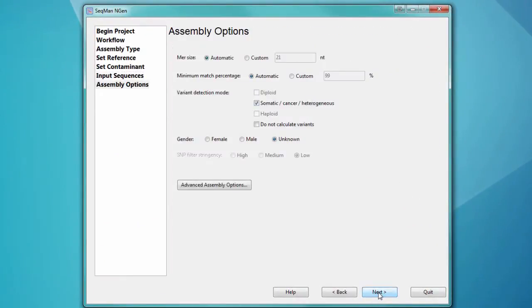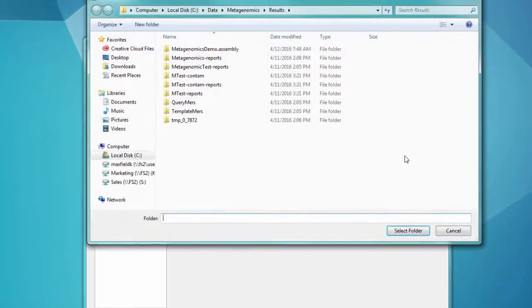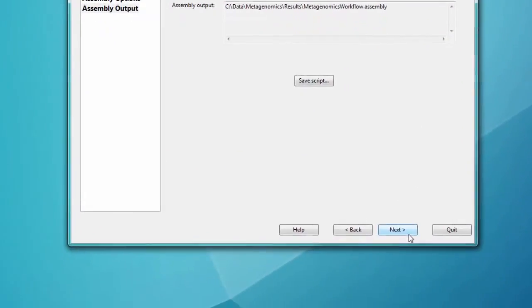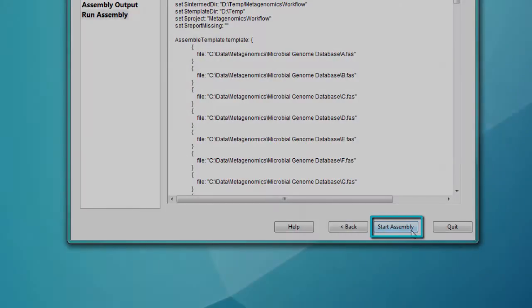Review the assembly options, then name your project and designate a save location. Next, start the assembly.